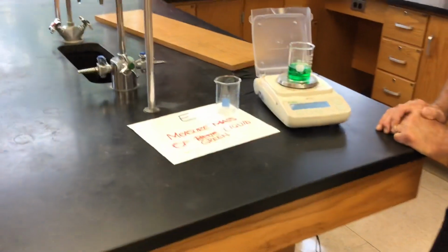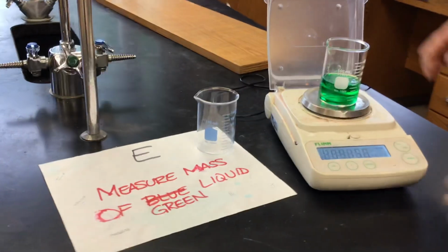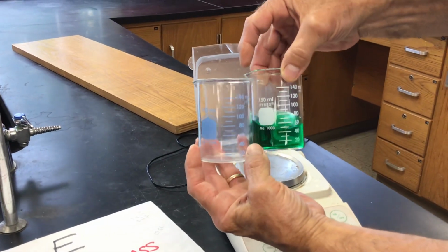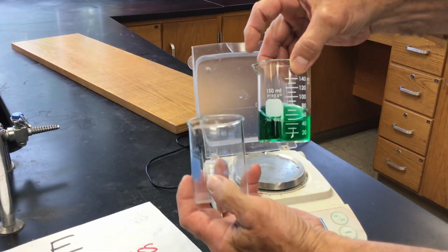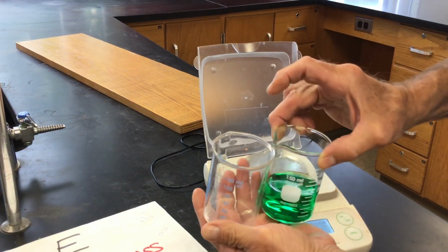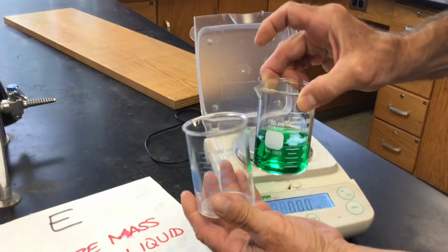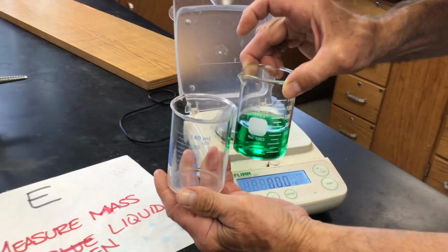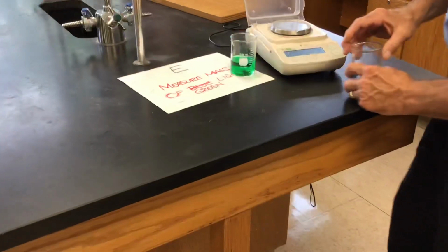Using those two measurements. Well, they both look like they're the same size beaker, don't they? In fact, they both say 150 milliliter. They do. This one has blue writing, this one has white. I can't say they're exactly identical. I think they're even different brands. So probably not. That may not be the best way to go.